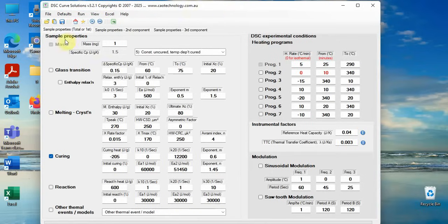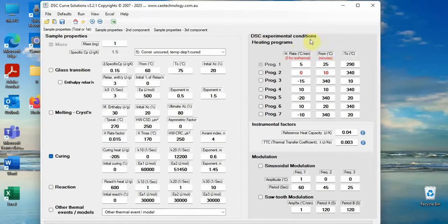Double-click on DSC Curve Solutions and the application window opens. You can see two panes: the left one is for sample properties and the right one for DSC experimental conditions. Let's see some examples.